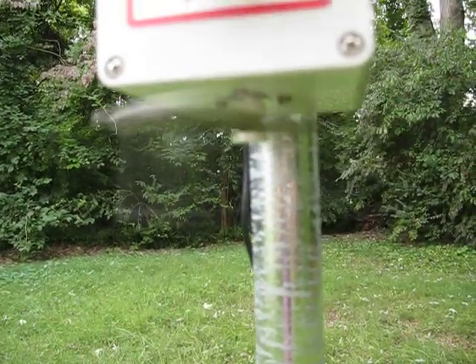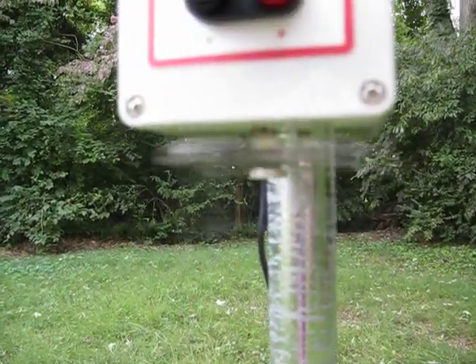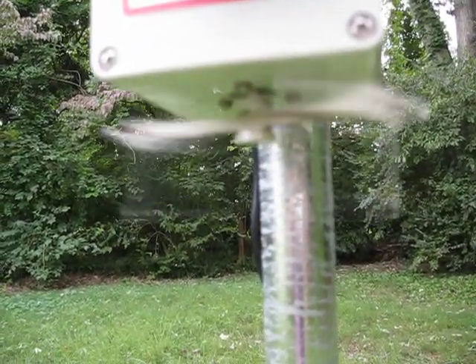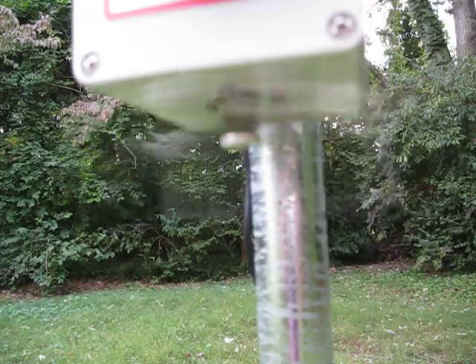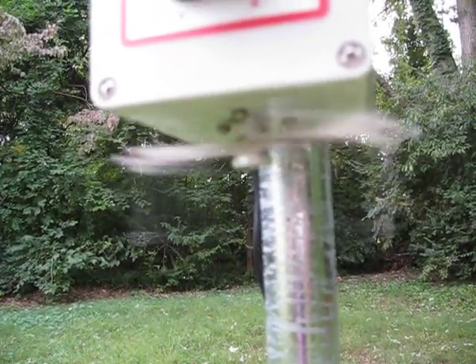We've got two rods turning around — plastic rods about four centimeters long, very narrow, maybe a millimeter or so wide, and their leading edge is coated with silicone grease. As these rods whirl around, they capture a sample of the airborne pollen in this particular location.